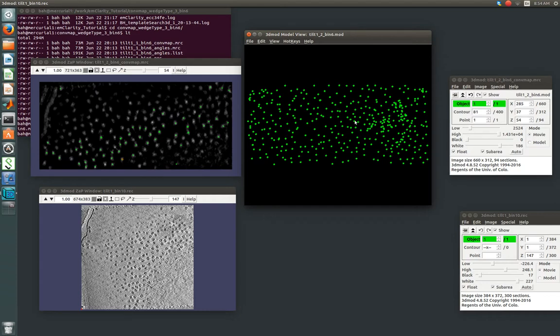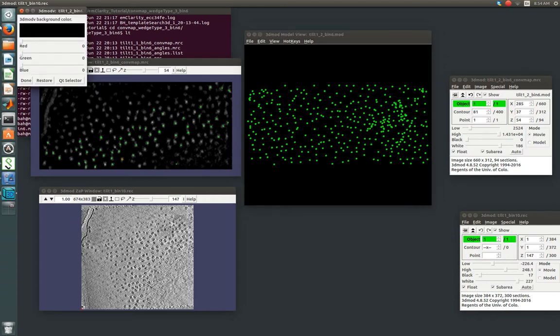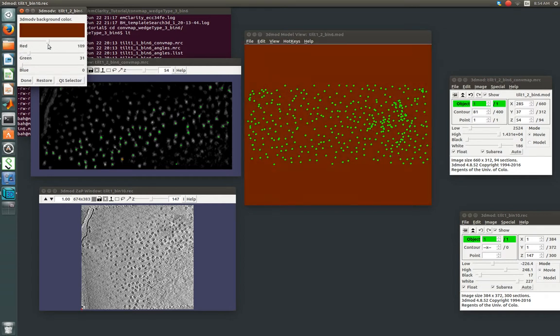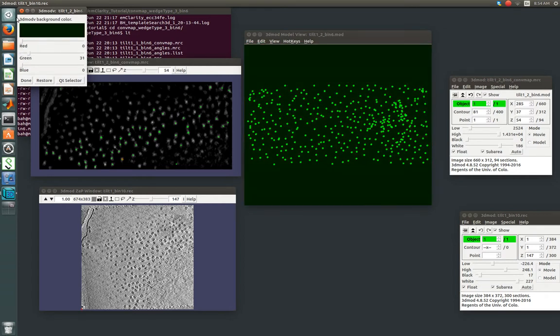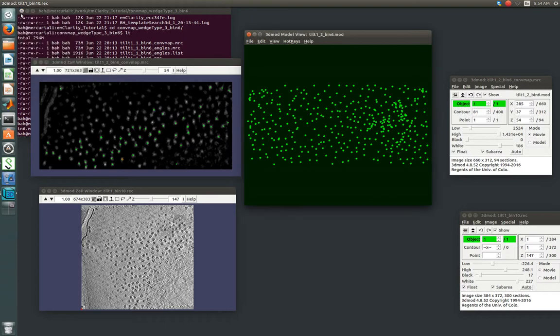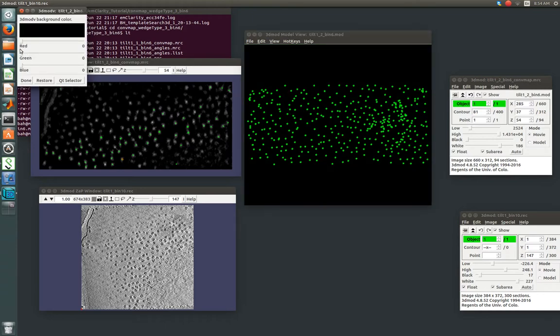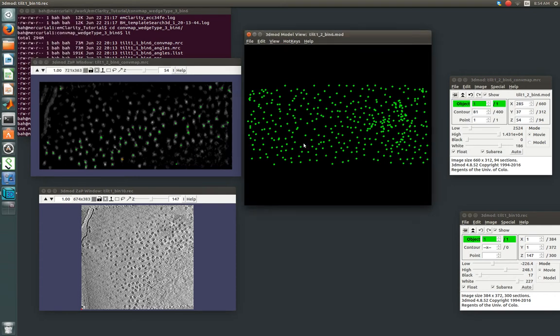And if you wanted to change anything in the model window, if you hit Shift and B, in particular you can change the background color if you wanted to make it a little easier on your eyes. Some colors of blue and orange make a decent combo. But we're going to leave it as black and green, just the default for now, because we're not going to spend too much time editing.